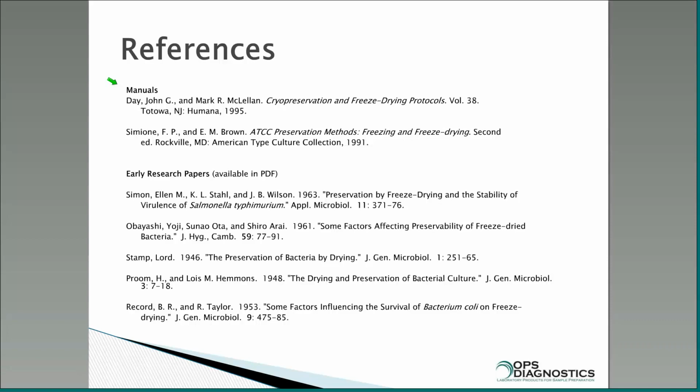One thing you might want to do in such a situation, if you can contain your organisms, let's say you fill them and put them in plastic bags and freeze them before you ever put them in the shelf dryer, then there's not going to be a lot of aerosols because you froze everything. So you can actually migrate them to different sections of the dryer, and once they're freeze dried, you're going to stopper them. So you may want to first freeze them outside the dryer and then put them in the dryer.